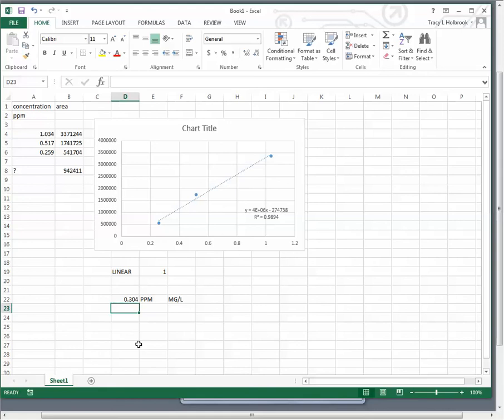So leading up to the competition, you will come into the lab and you will run samples that you've made on our HPLC instrument to get these areas. And you'll take these areas for your standards that you've made, and you'll plot them, and you'll get a calibration curve. And one of the things that we will judge is how close are you to 1. The closer you are, you're going to beat the other teams out.